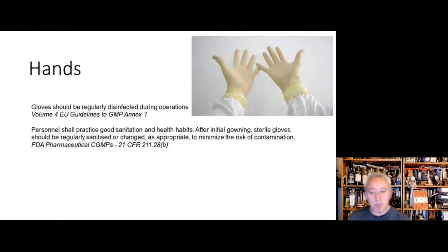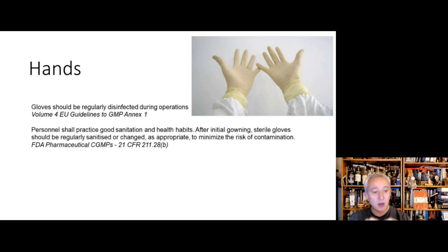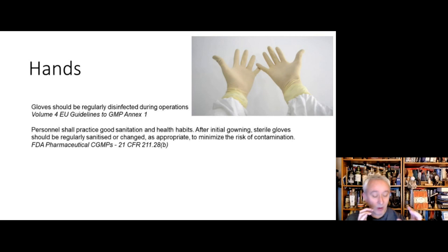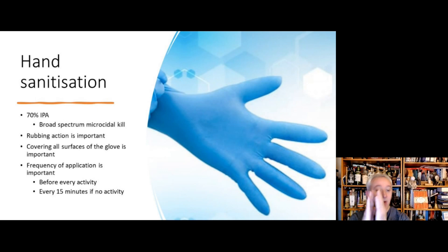We're going to start with looking at hands in the clean room. Good hand disinfection is built into the GMPs. EU GMP Annex 1 says gloves should be regularly disinfected during operations. The Code of Federal Regulations FDA says people need to practice good sanitization and health habits, including the wearing of sterile gloves, and that these are regularly sanitized in order to minimize the risk of contamination.